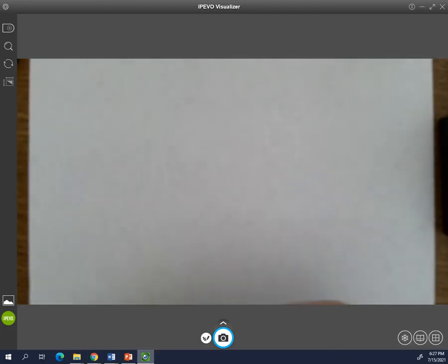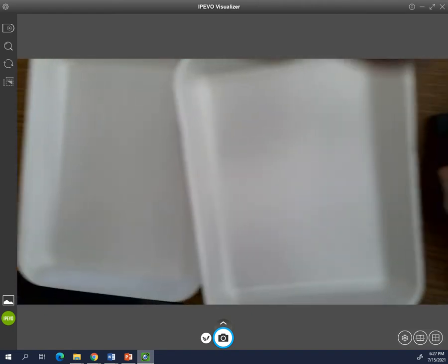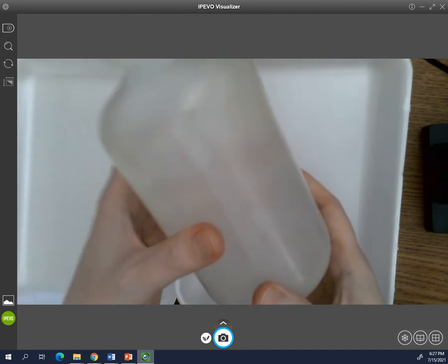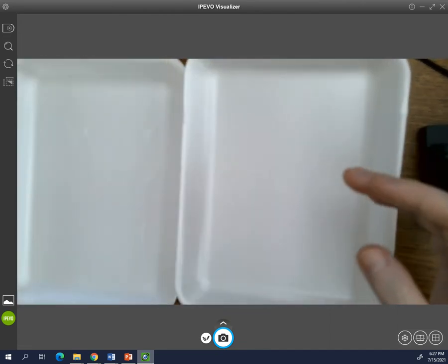Okay, so for this lab, we will need 2 small paper plates, which I have these little trays here we're going to use. Tap water, I'm using distilled water since I'm performing this at my desk so I can have a camera here. So we're using a bottle of distilled water.